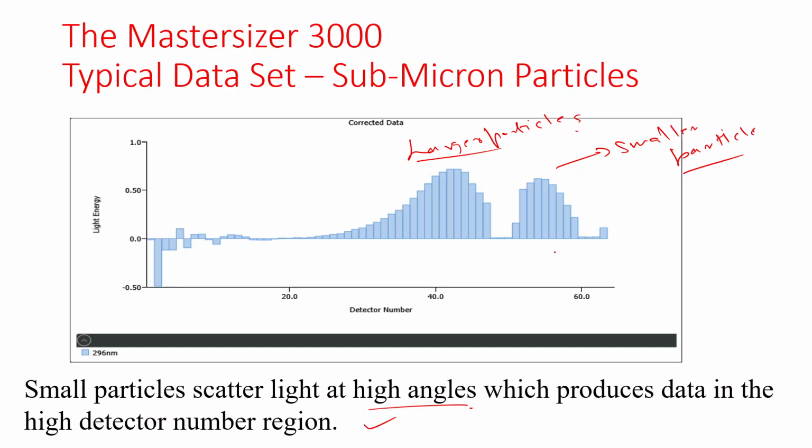Here we can see one more thing to tell you, that two types of light are used, laser lights. One blue light is used for detecting the small particles, and we are also using red light, which detects the broad range of particles. So the instrument uses both blue light and red light to determine the wide range of particles in the solution.